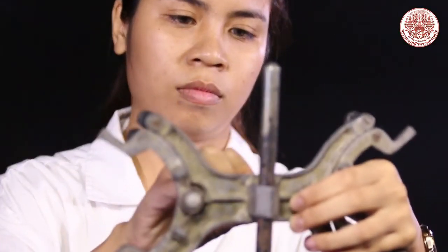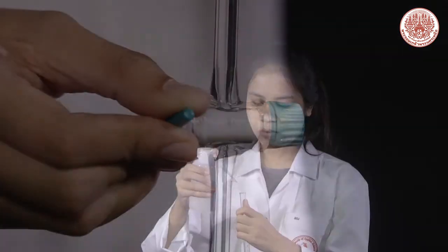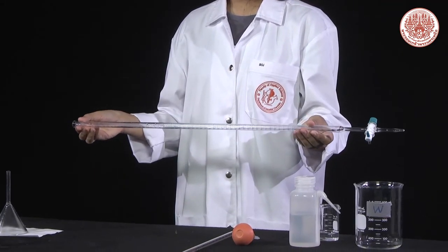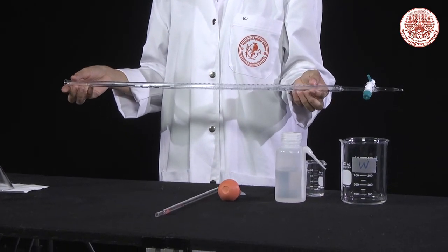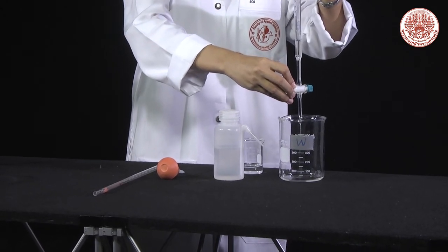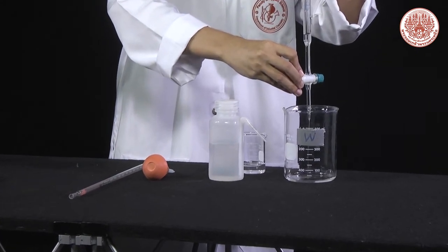Clamp the burette on the stand. Close the stopcock and add about 5 ml of water to roughly rinse by turning the burette horizontally and rotating it so that the water contacts the entire inside surface of the burette. Drain the rinse through the tip into the waste container by opening the stopcock.